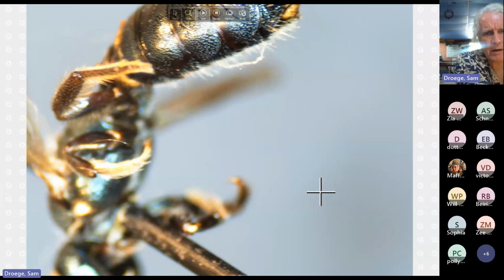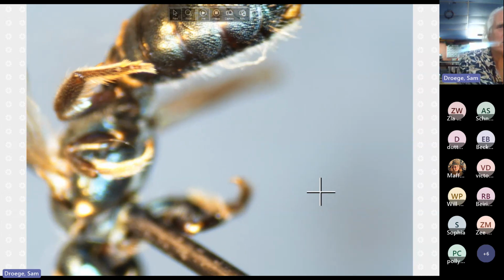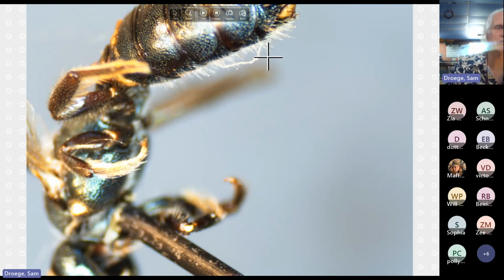This is good. I could turn this a little bit more. We're not exactly seeing the entire underside, but you can already see down here a much greater amount of white hair sticking straight down and exposed. That's what defines that species from mikmaqi. Those white hairs, if you look straight down, sort of disappear because they're semi-translucent.